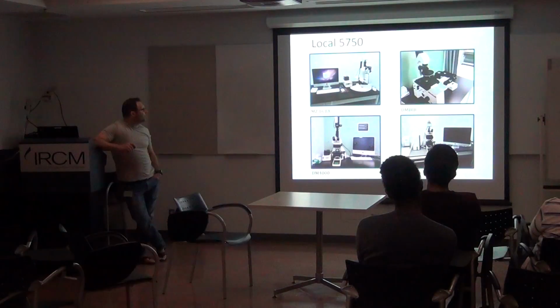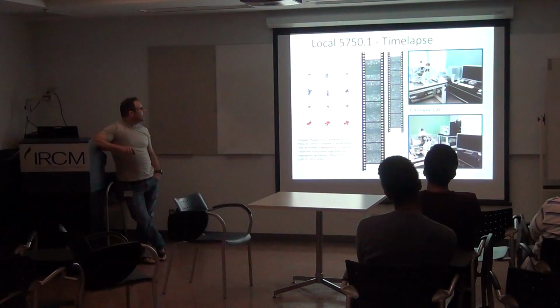And next, room 5750, where you have many other microscopes mainly used for fluorescence, and two inverted microscopes where you can produce time-lapse movies. Time-lapse is just taking many images at different intervals of time, and therefore you can produce a movie.